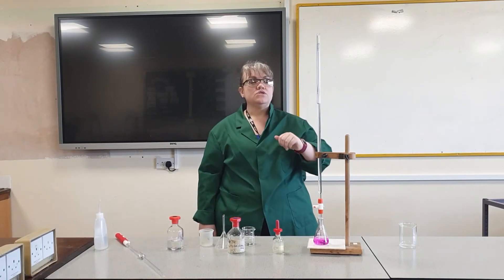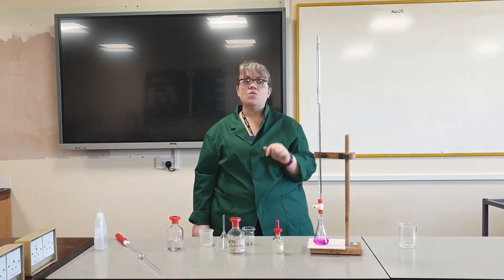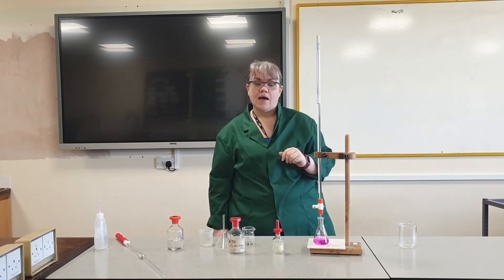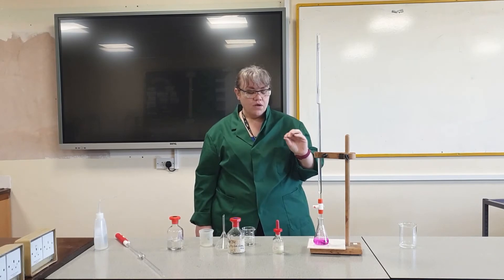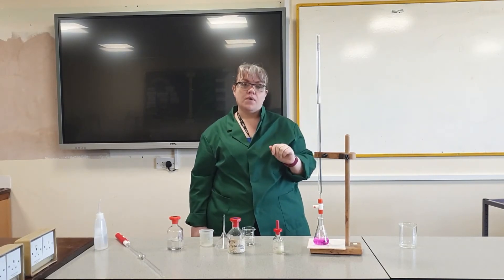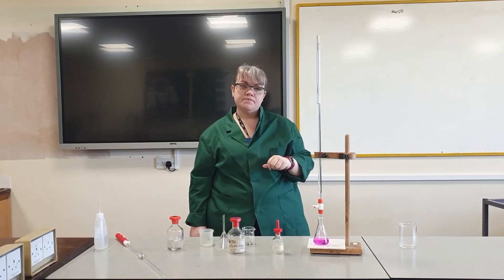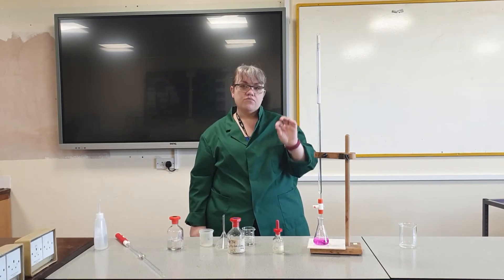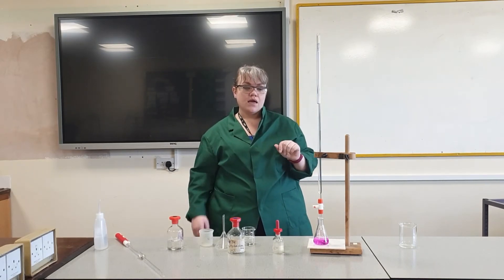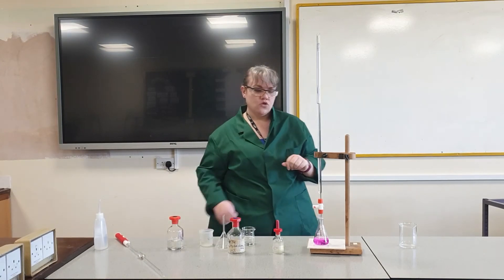I've gone down to 20 centimetres cubed, so I know I'm near where the neutralisation is going to happen. From now I'm going to do it drop by drop, very slowly, making sure I'm continually swirling. That way, when I see the colour is about to change, I can stop it and add one drop at a time, swirling between each.